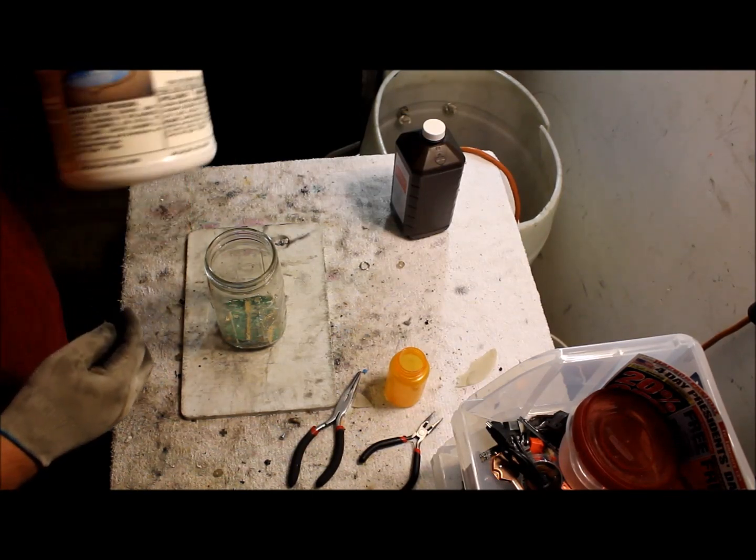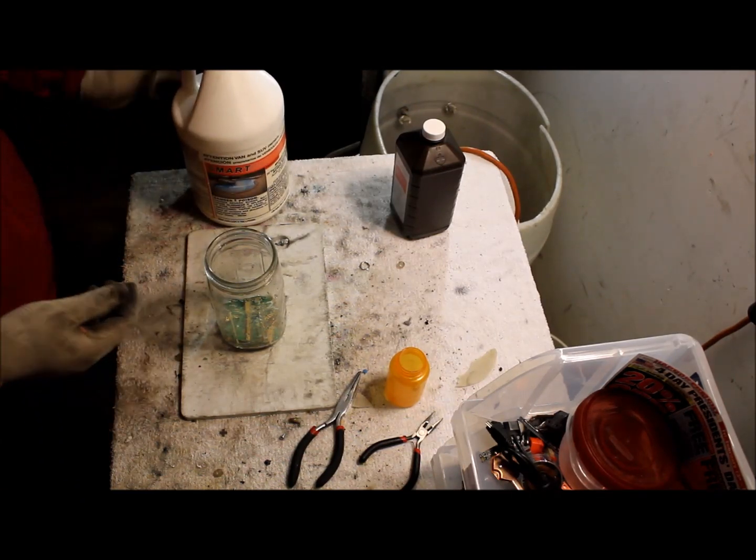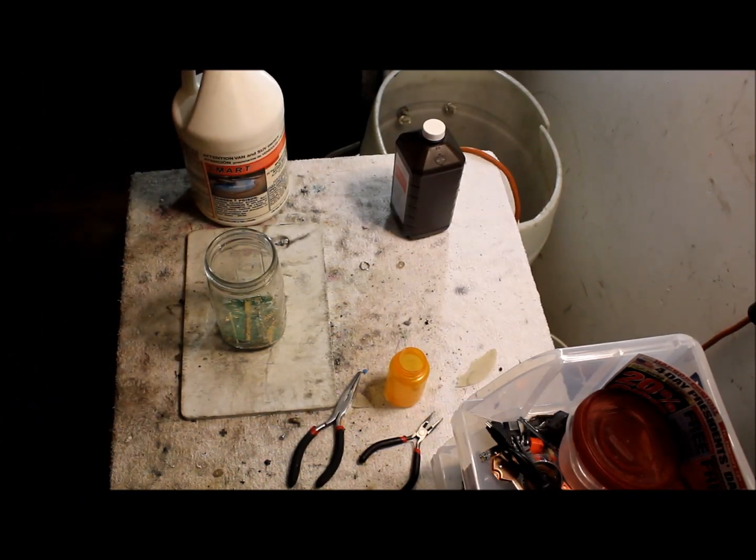Always wear a mask when using this — the fumes are really toxic. So I'm gonna put on my mask right now, and I apologize if I sound a little muffled. But this is for my health and safety. So here we go.